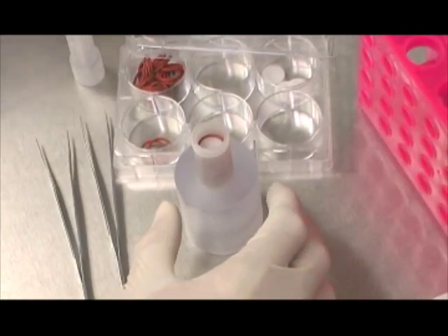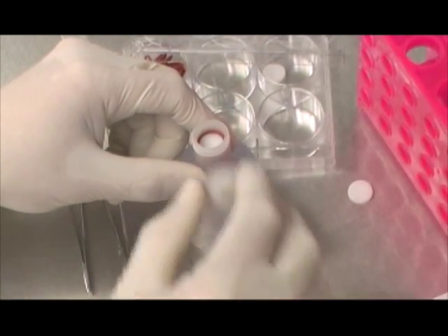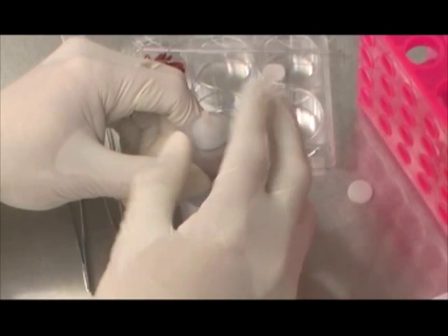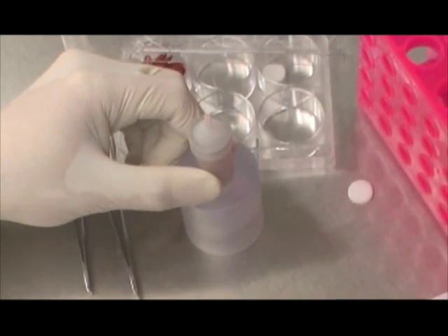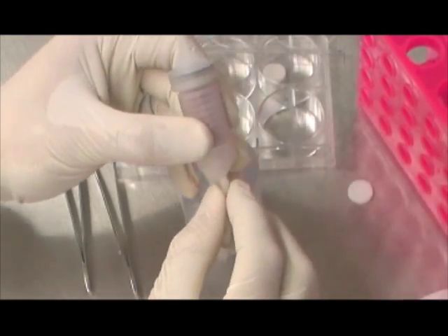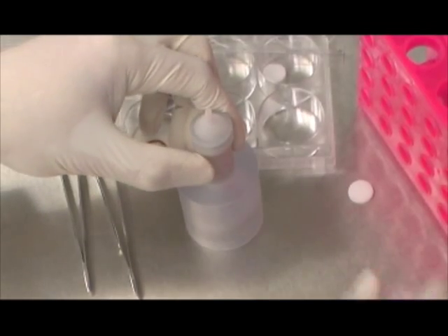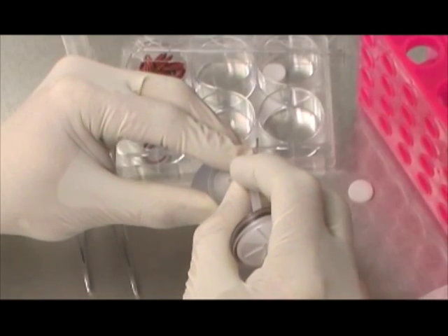Repeat the same loading sequence until stacking a total of 10 scaffolds, dispensing each scaffold with the required cell suspension volume. Once the whole bioreactor chamber is loaded, close it with the bioreactor chamber cap. The bioreactor chamber must then be prepared for static incubation. Place a piece of silicon tubing with a ball bearing to seal the bottom of the bioreactor chamber, then place a piece of tubing with a syringe filter on top to maintain aseptic conditions and prevent contamination during transit.